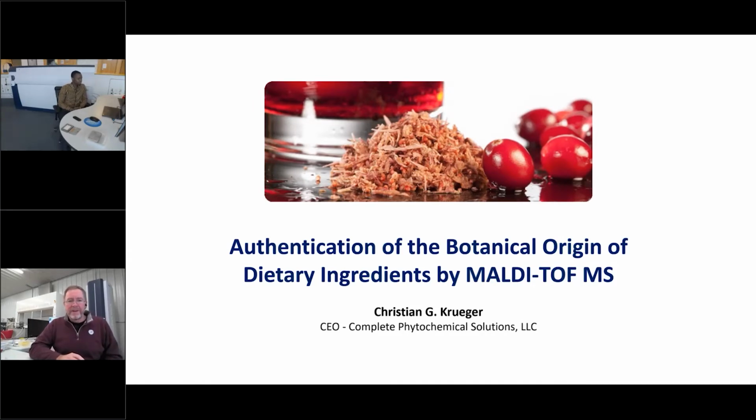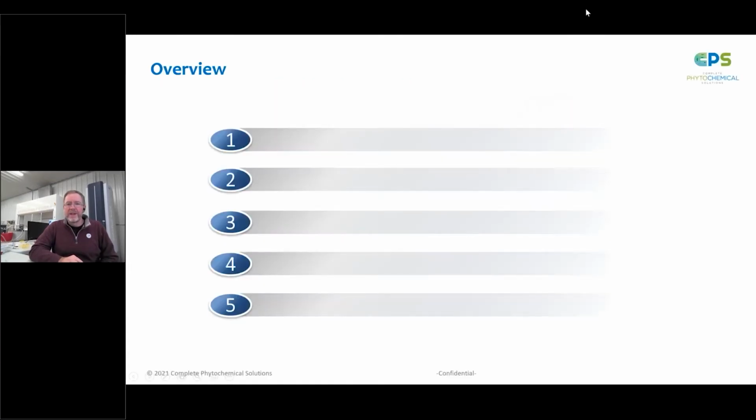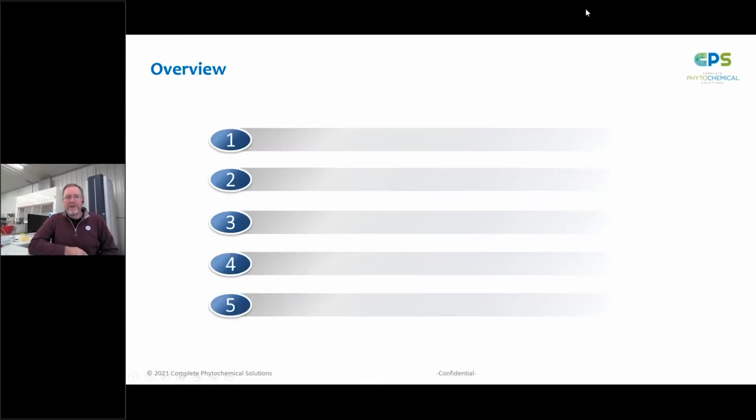Thank you, Pierre, for the introduction here. This is the third webinar we've put together with Bruker and CPS, so I'm excited to share some new and exciting workflow demonstrations today. One of the things we're looking at here is the application of MALDI to identify oligomeric polyphenols.